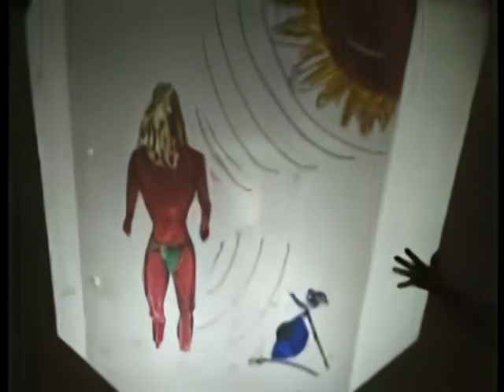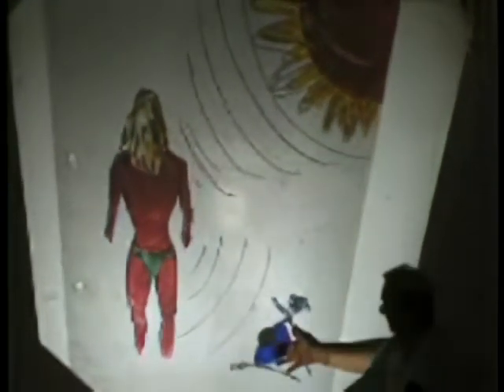I mean, if you want to see that Bondi Beach surfer there, you have to shine some light on it, and then the light is reflected into your eye. So today, we're seeing each other because the light shining on me, you pick it up in your eye. In the jargon, you need a beam of radiation. It might be light, it might be electron beams, it might be other particle beams. They shine on the object that you're interested in, and then this radiation scatters from that object into something called a detector, of which the eye is a particular example.